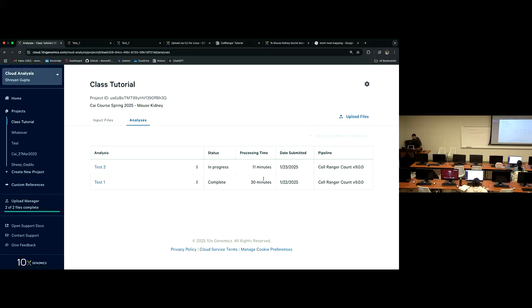Okay. So the previous one that I actually tested out finished in 30 minutes. So we'll just have to wait for this to reach 30 minutes or 35 minutes, and it should finish. Then you can port it into MATLAB.